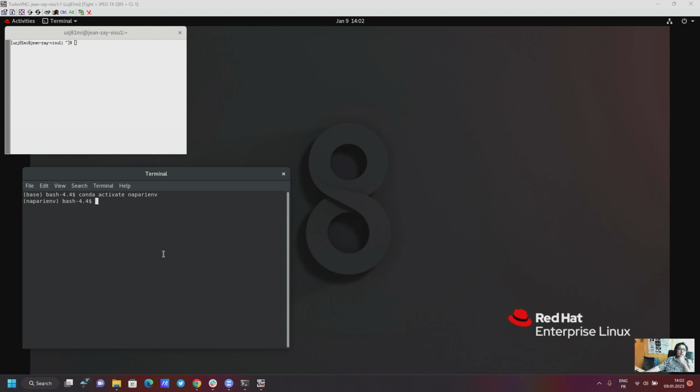In this video, we are going to talk about the TrackMate-Napari plugin for doing track analysis using the TrackMate XML and CSV files, and I'm just going to show you what the plugin has so far. Still, the plugin is in development, and I'm going to add more features to it. Let me just navigate and show you the current features which exist in the plugin so far.